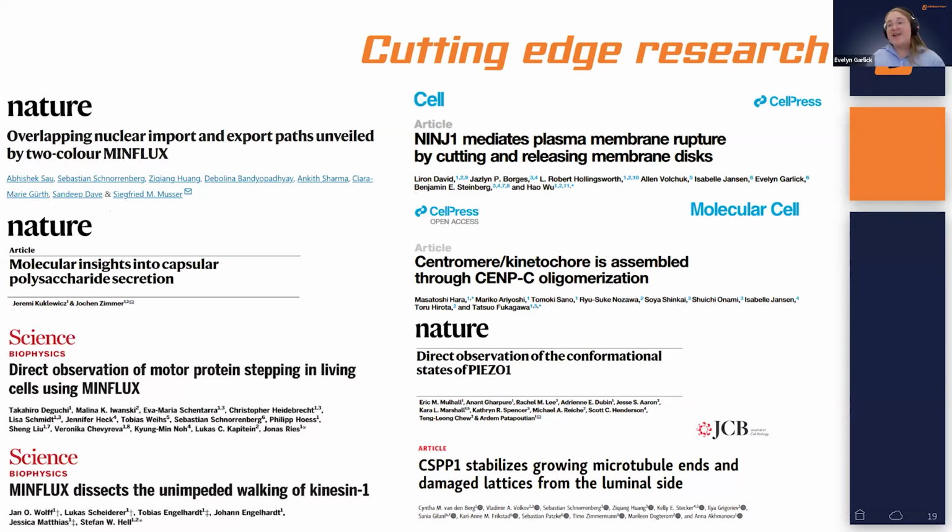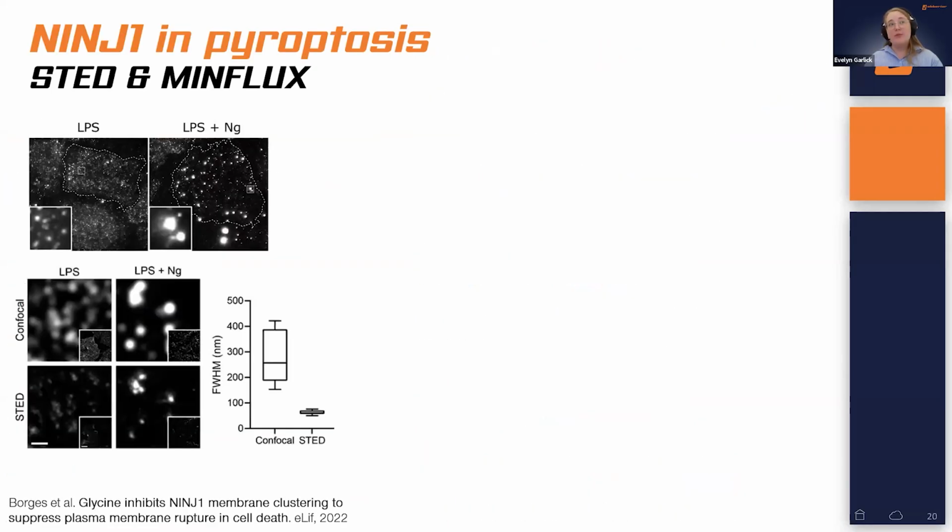So, again, as Xiaoyu's already touched on, there's been a lot of cutting edge research in the last few years with MINFLUX. It's been really wonderful to watch how the technique has developed, as the first commercial systems went into labs in around 2020, and now the field is blossoming. There's a lot of very important research being done with these systems.